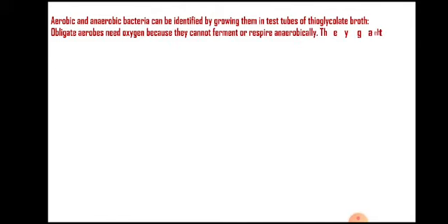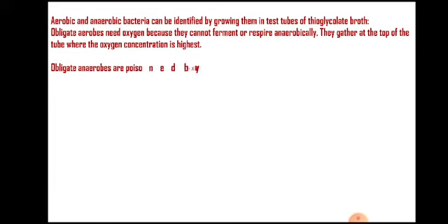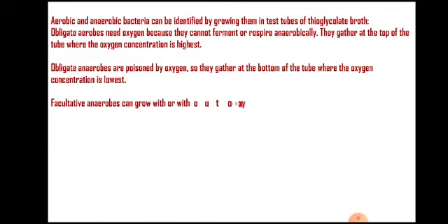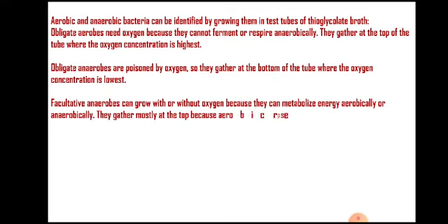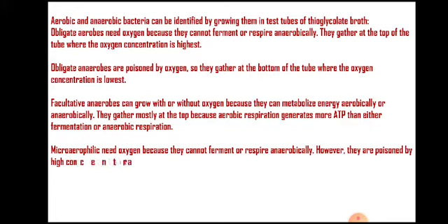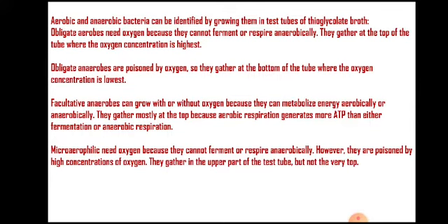So this pattern we have already learned in the last slide. So there will be different patterns of growth for aerobes, anaerobes, obligate bacteria, facultative bacteria, and microaerophilic bacteria.